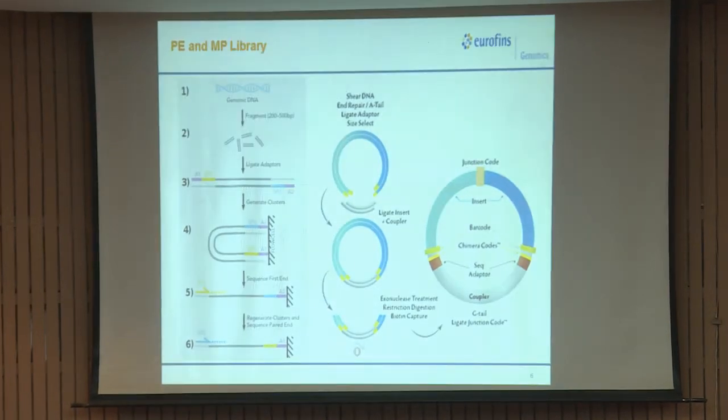Aggregate each sample wise sequences. Hope you are following me. So, these small 8 bases sequences for that particular sample will be exactly identical. Based on these 8 bases, software segregate the data sample wise. So, we know after sequencing when we get a whole FASTQ file, from there we segregate sample wise based on these small 8 bases indices. These are called Illumina indices. So, the Illumina indices is there, after that we have the sequencing adapter and then I have the DNA template.